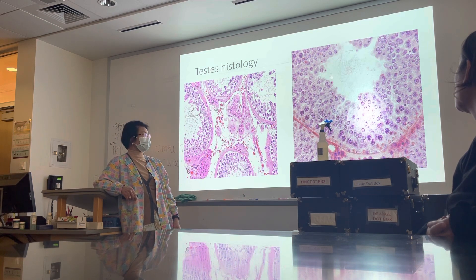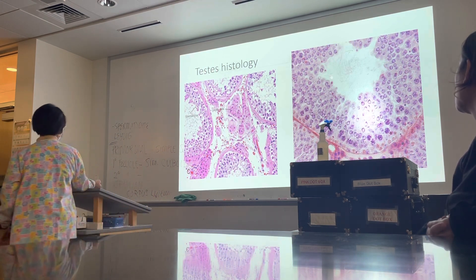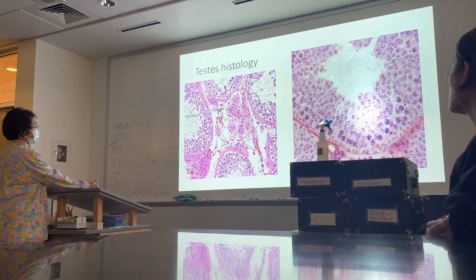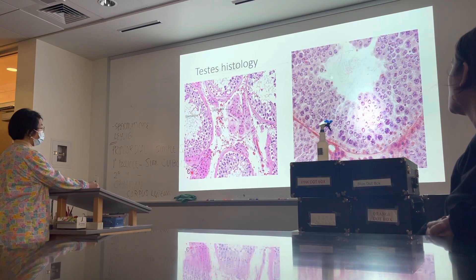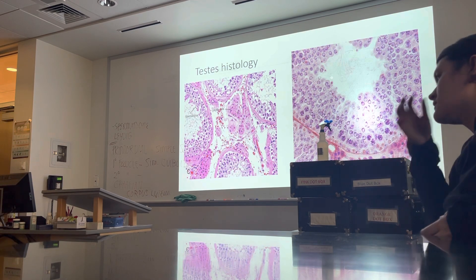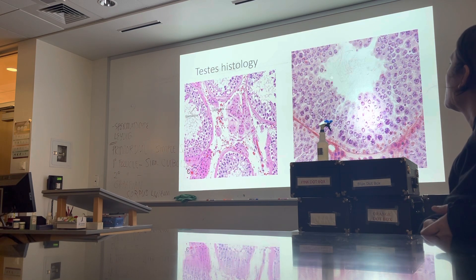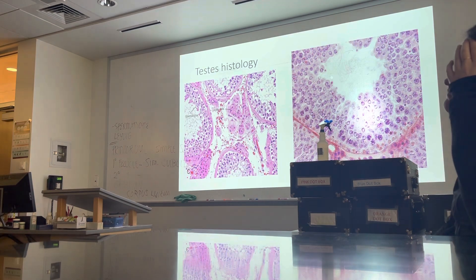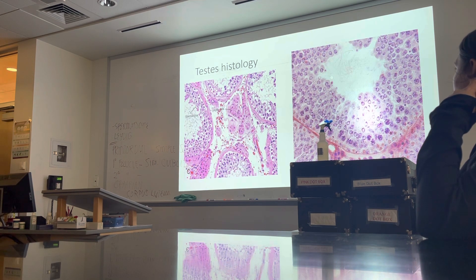Next, you're going to point to the space in between. The space in between is the interstitial space, where you can find the interstitial cells of Leydig, right there. There are red blood cells here — don't point to those. Just point to the interstitial space. The purpose of identifying those two is for you to be familiar with the seminiferous tubule that contains the sperm and Sertoli cells, and the space in between that has the Leydig cells, which use cholesterol to make testosterone. That's it — very easy for the testes slide.